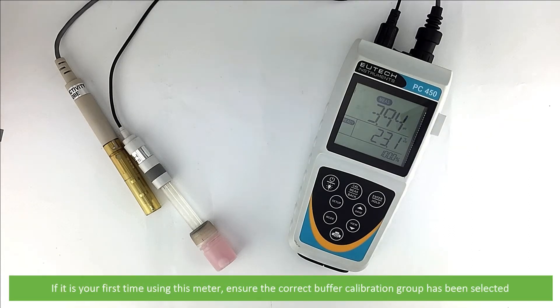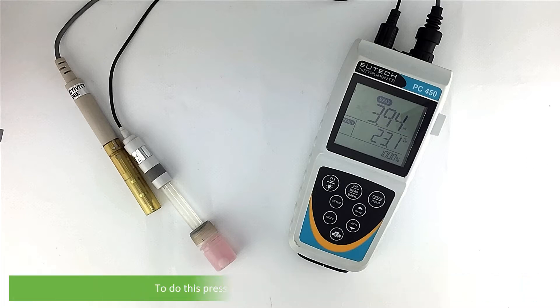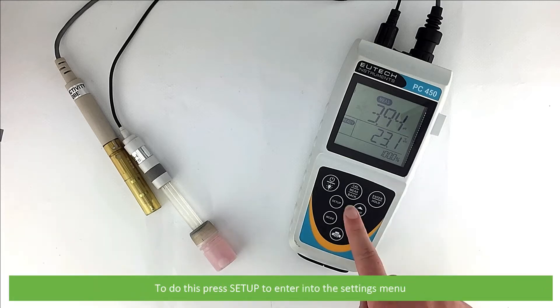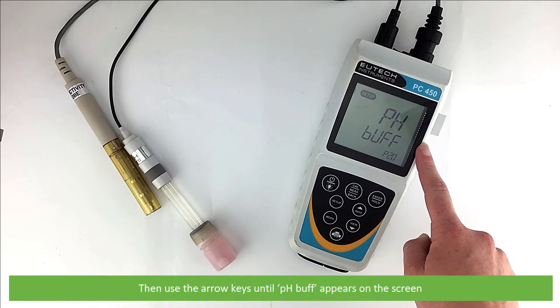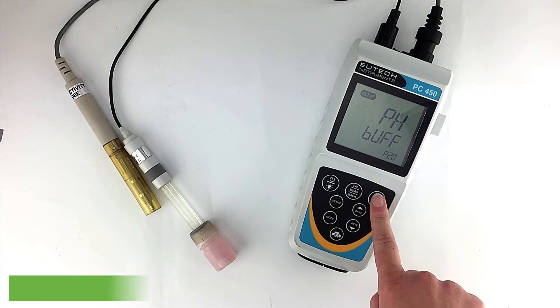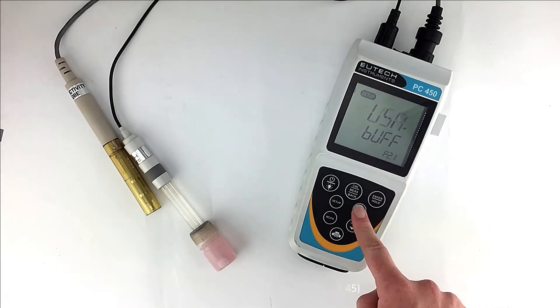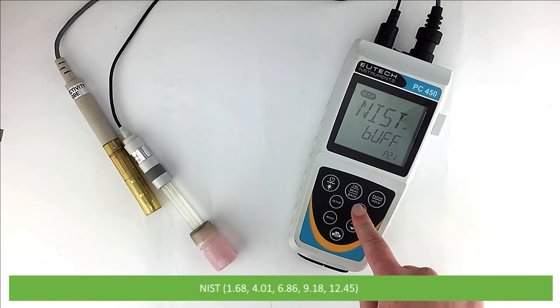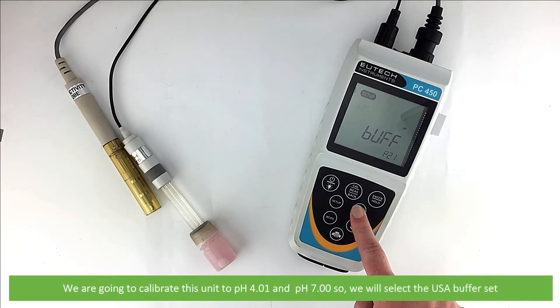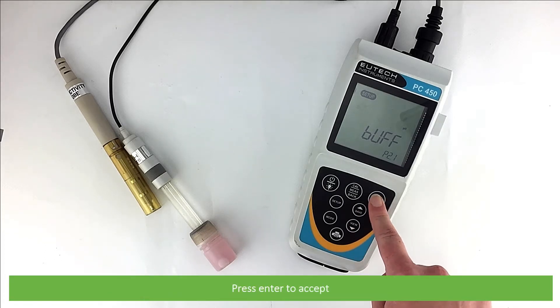If it is your first time using this meter, ensure the correct pH buffer calibration group has been selected. To do this, press Setup to enter into the Settings menu. Then use the arrow keys until pH buff appears on the screen. You can select between USA, Manual Adjustment of Buffers, DIN, or NIST. We are going to calibrate to the standard pH unit of 4.01 and pH 7, so we will select the USA buffer set. Press Enter to accept.